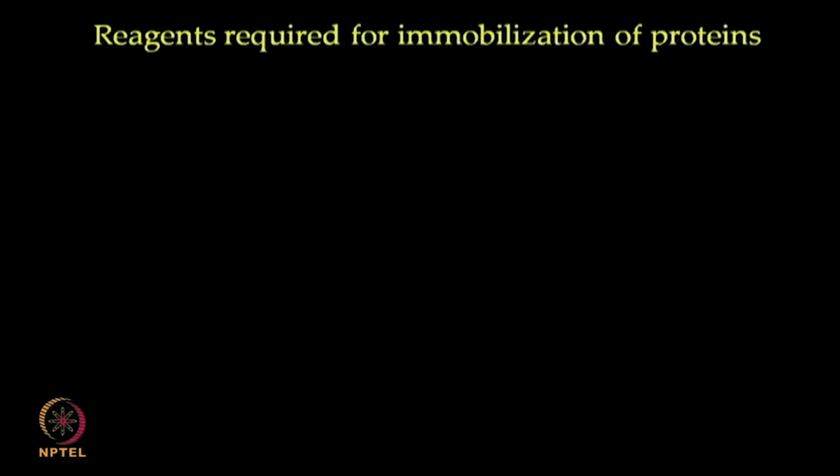As per the volumes listed on the table, we will now prepare buffers and reagents required for immobilization of these two proteins on the sensor chip.